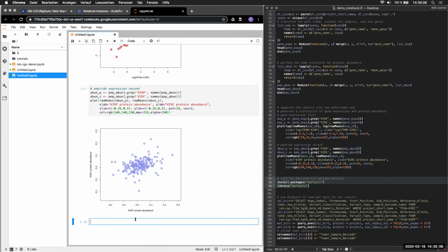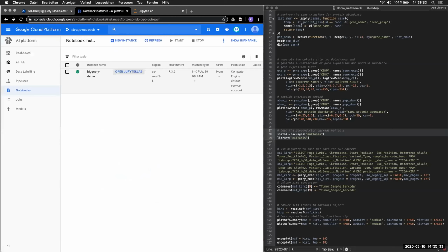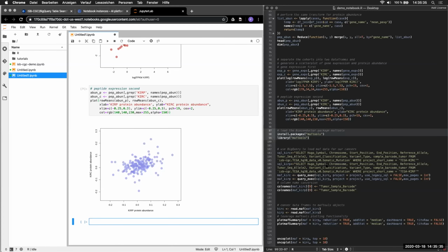And then the other nice thing is, this is just an R session. Every biological researcher is pretty comfortable with R almost nowadays. You can boot up a Pandas or a Python notebook as well. You can use whatever analysis tools you want. And if you have other data analysis pipelines you have to run, the more nitty-gritty alignment stuff, you can always boot up a VM in the Google Cloud Platform as well. But you can load all these Bioconductor packages as well.